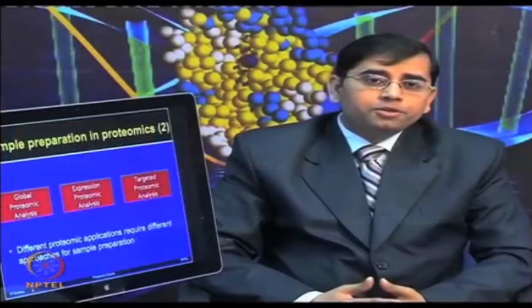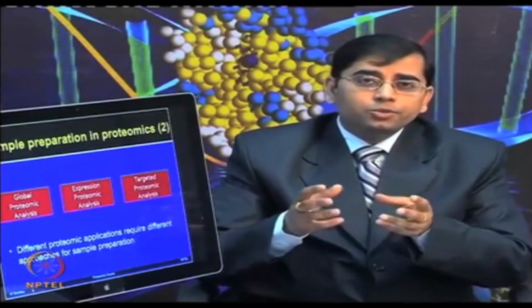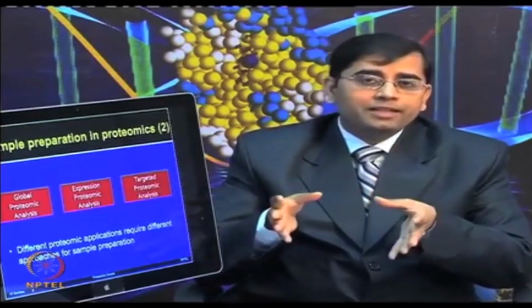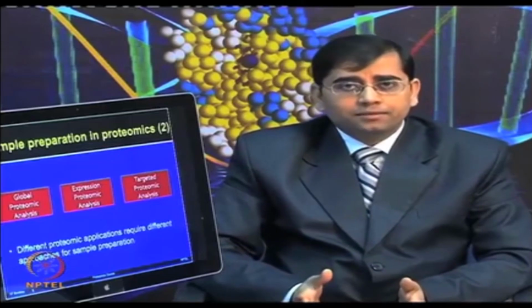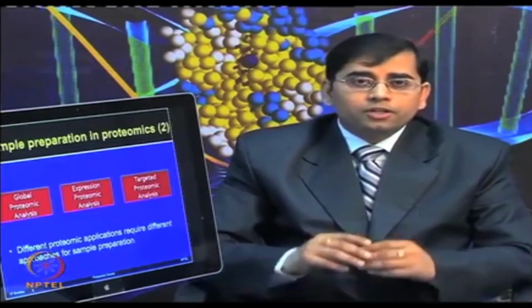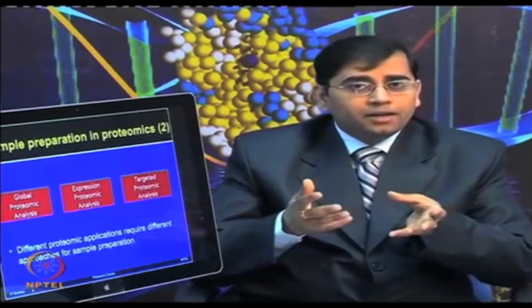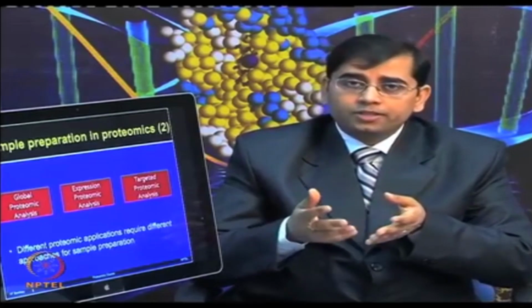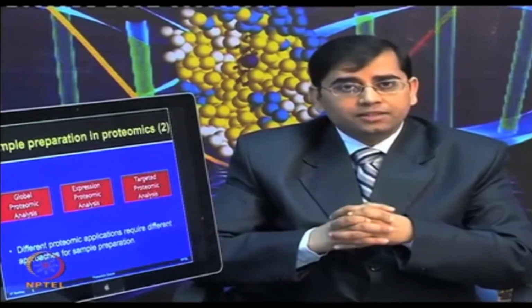When I am talking about global proteome analysis, it means your aim is to characterize all the proteins present in the given sample. Expression proteome analysis means you are mainly interested to look for those changes which are due to any chemical or your treatment, those are induced either going up or down, the protein amount is changing.